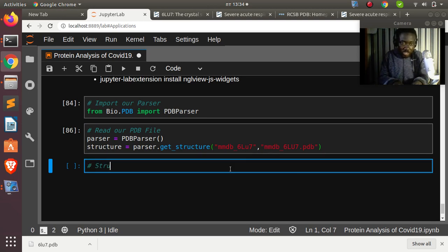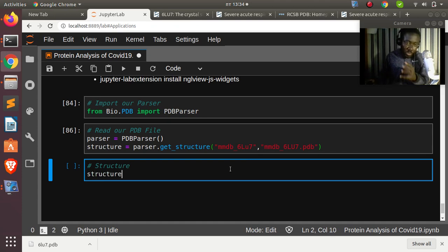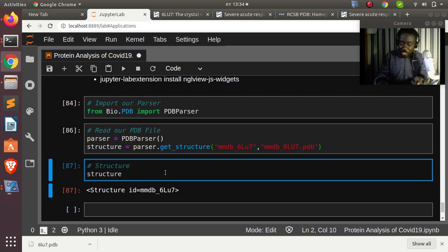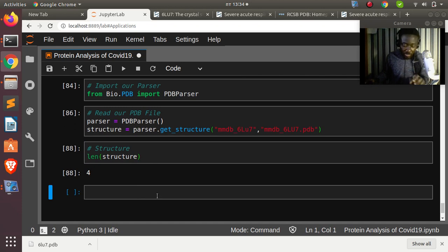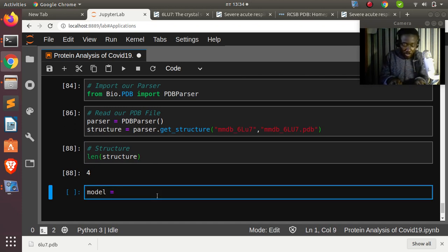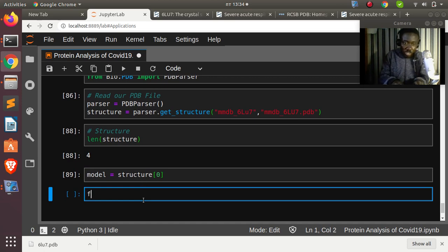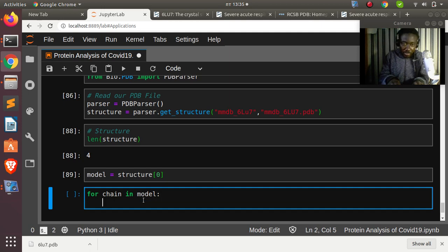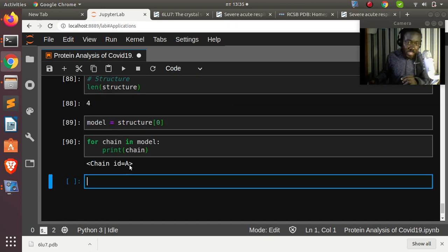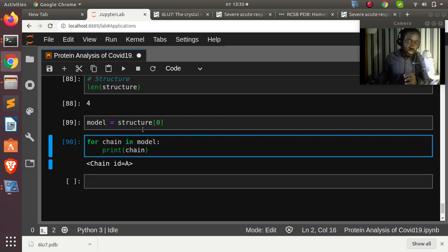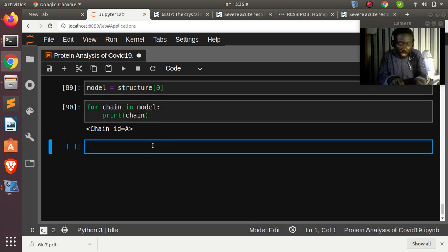We can iterate through the model to find chains: model = structure[0], then for chain in model: print(chain). This lists all four chains with their IDs. You can also get the number of atoms and residues from each chain.